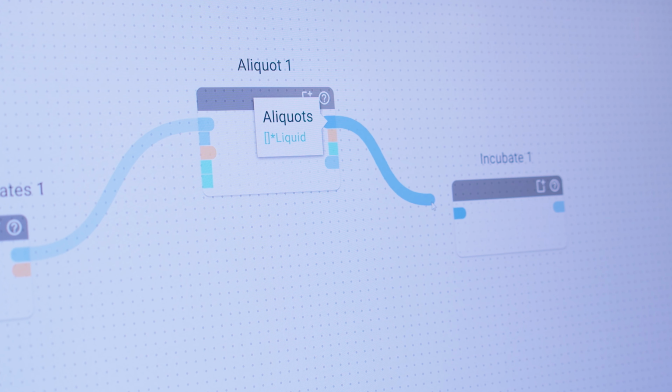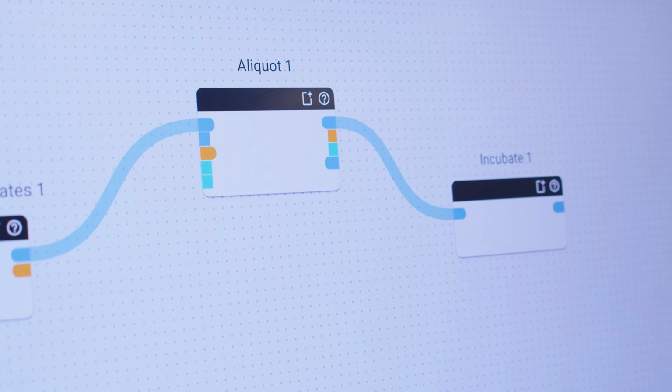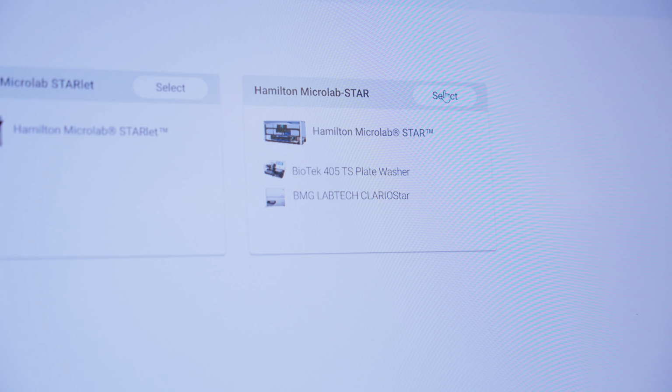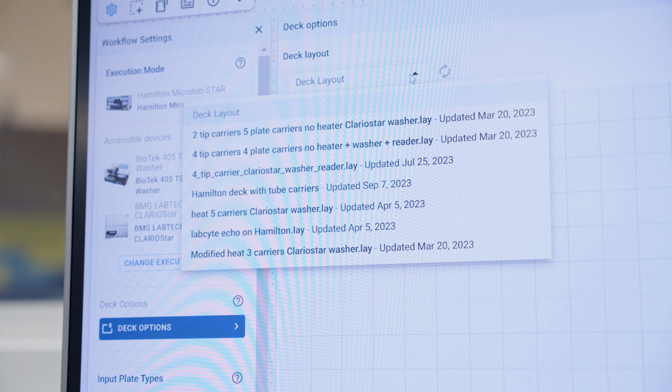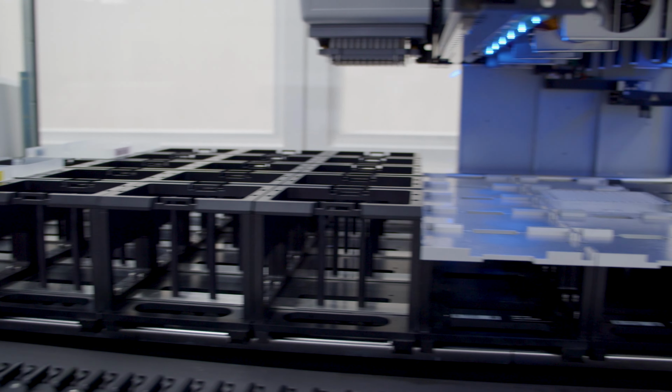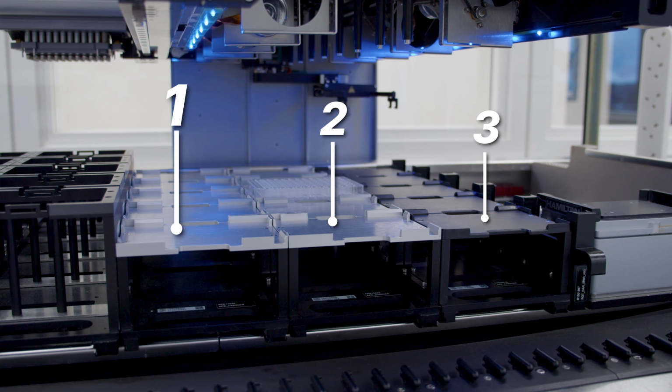First, make your workflow in Synthace. Choose Hamilton as the execution mode. Select the deck configuration which matches your current setup. In our case, we've got 4 tip carriers and 3 plate carriers.